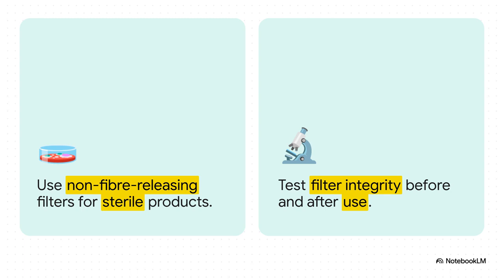But beyond that, for all products, filter integrity must be tested both before and after use. You need hard, documented proof that the filter was intact before we started the batch, and equally solid proof that it didn't rupture at some point during the process.